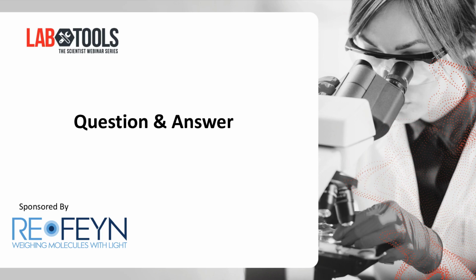Okay, great. This is a follow-up question about trying to look at interactions with multiple spike proteins. Would it be possible to coat different spike trimers, like two, for instance, on a surface, and then look at the interaction with mass photometry? It's a bit tricky. I mean, that begins to approach the assay format of biolayer interferometry. I know there's been some work by other labs with functionalizing their glass surfaces. It would perhaps be possible, but if I can guess what the intent of that question was, there may be better ways to probe that. For example, if you just wanted to fuse two spike trimers with a linker, that would probably more clearly address that research question.